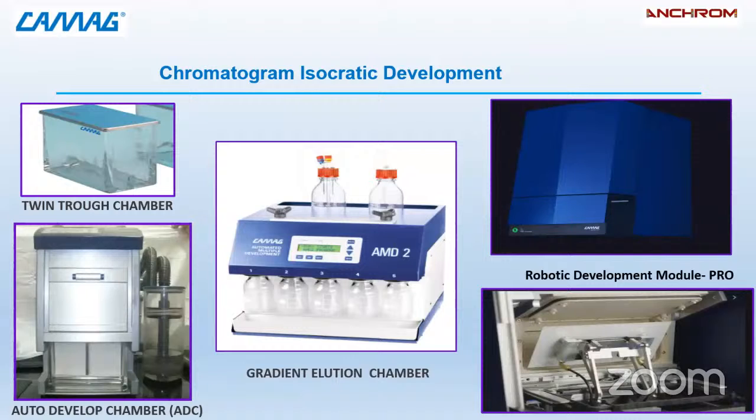After sample application, we can develop the plate in a suitable mobile phase. For that, we have three major options available: twin trough chamber, auto development chamber, and gradient elution chamber. Twin trough chambers are most popular, most people use them. But if you want to comply with GLP requirements, in that case, one can go for ADC. And when you are dealing with very complex samples having multiple polarities, in that case, one can use a gradient elution chamber.